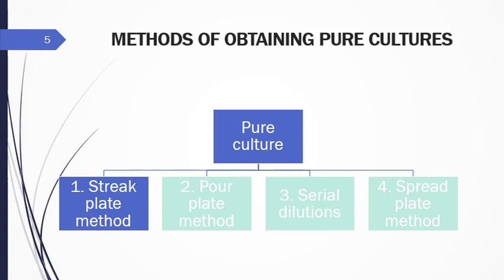Today, pure cultures are obtained by isolating the progeny of a single cell. Simple as it seems now, the technique of isolating pure cultures was difficult to develop. Attempts to isolate single cells by serial dilution were often unsuccessful because two or more organisms of different species were often present in the highest dilution.